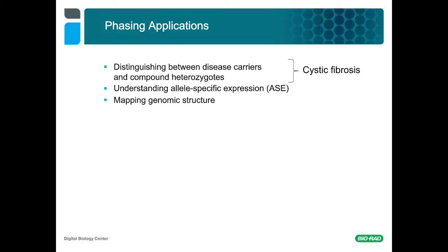A second application is understanding allele-specific expression, and a third is mapping genomic structure. Today, I will be presenting ddPCR as a tool to make advances in these applications.